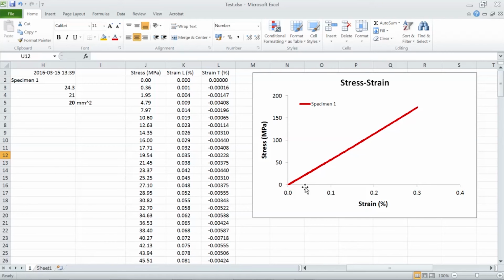Just remember that stiffness can be obtained from the whole curve or from part of the curve. We usually do it from part of the curve, just to remove some strange things that may happen at the very beginning and at the very end when you start unloading a sample. And usually you would do that from unloading curves rather than from loading and unloading together. But in this case, because the lines are coinciding, it's pretty much the same thing.